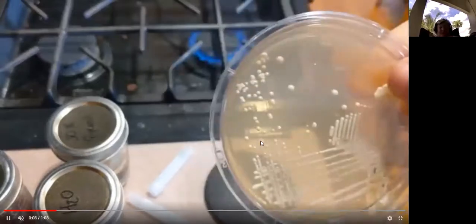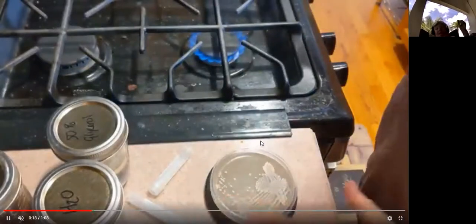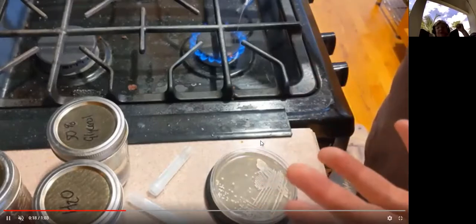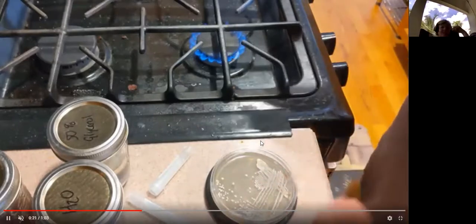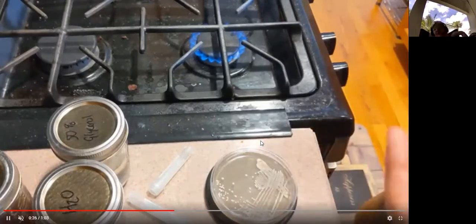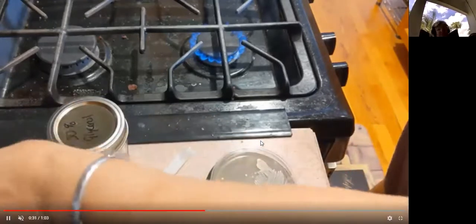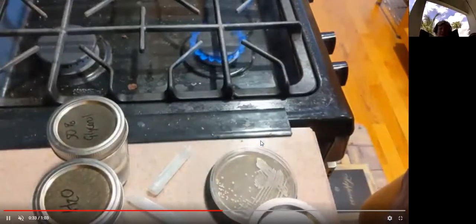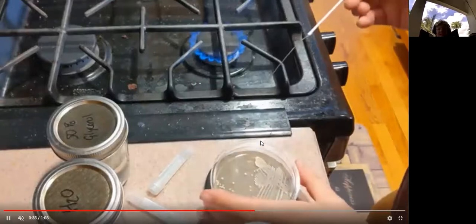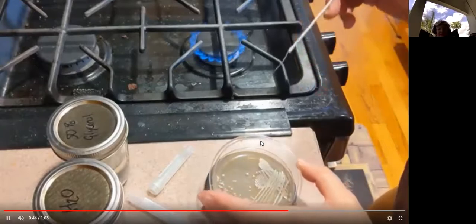So to do this, I'm going to sterilize a loop by heating it in a Bunsen burner, aka my gas stove. Let the loop cool because I don't want to kill my yeast. That is a very bad idea. Hot kills yeast. And I'm going to take my jar of malt extract liquid. I'm going to carefully pick up a single colony of my yeast.